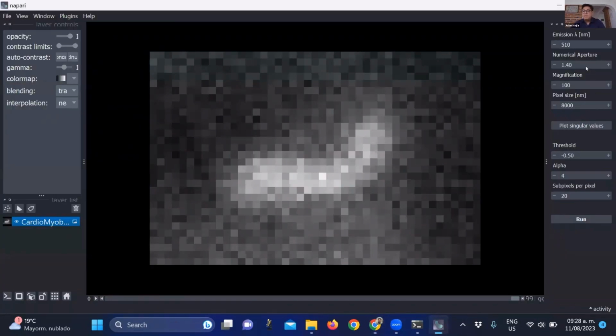Okay, so going back to the analysis of the image, we have here the parameters that are already selected for this image, which I mentioned before is the sample that the MUSICAL team provides. And the pixel size, in this case, is the pixel size of the camera that you're using. There are some parameters that might be difficult to get.